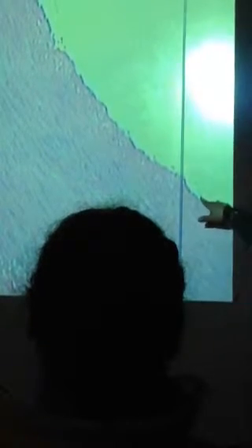See all these little dark things? Those are what? Smooth muscle cells. Notice here on the surface, you see all the nuclei of the simple squamous epithelium. Sometimes they break loose, you know, just because of artifactual things. See how they stick out in the lumen sometimes? Okay? And then this is the tunica externa.